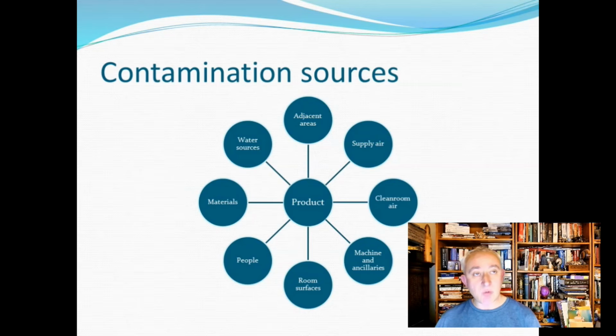We have surfaces where contamination can settle through deposition or from touch contact, touching a contaminated surface, going on and then touching a supposedly clean surface. And then we also have water and water sources. And water is both a growth source for many types of microorganisms, and it's also a vector of contamination through leaks and aerosol transmission. But most importantly, the fundamental source of contamination within clean rooms is from people.